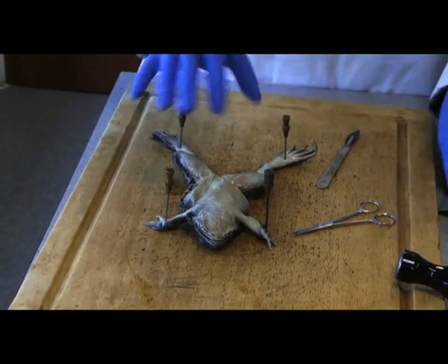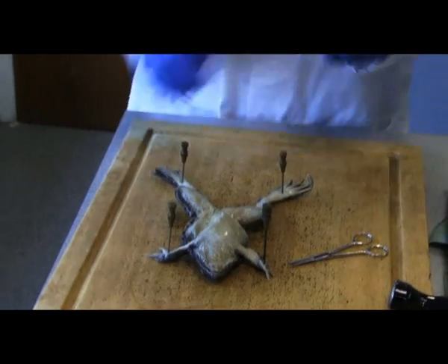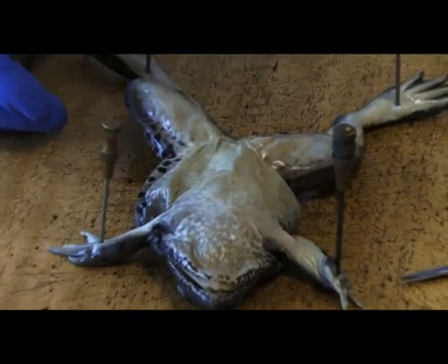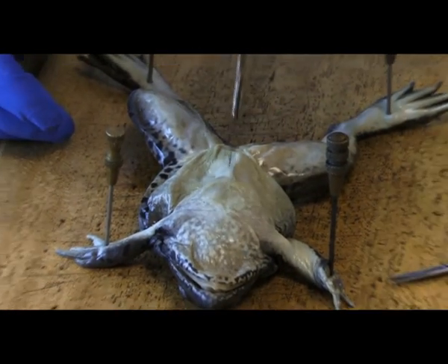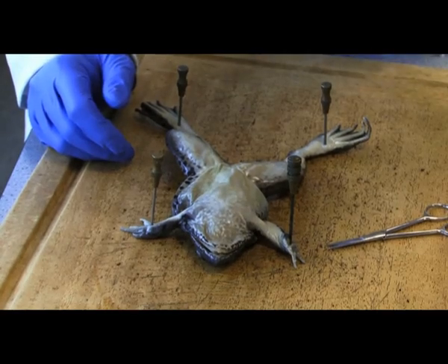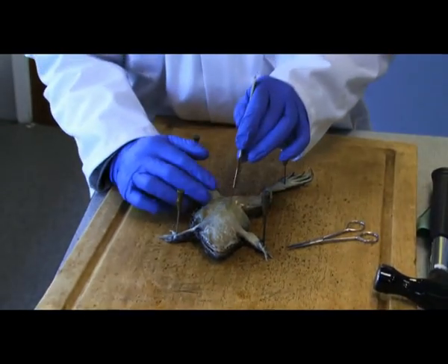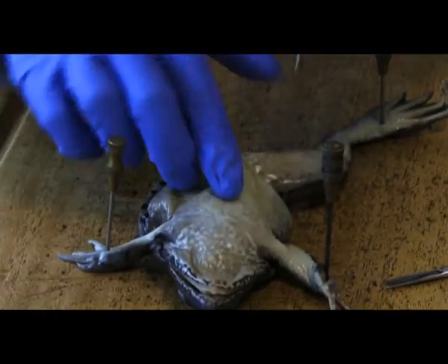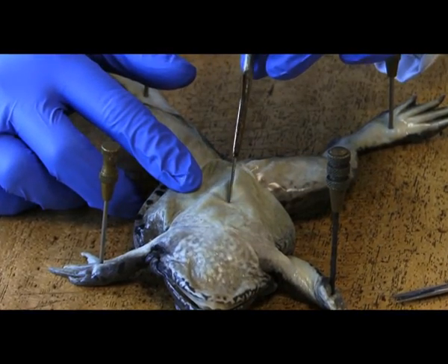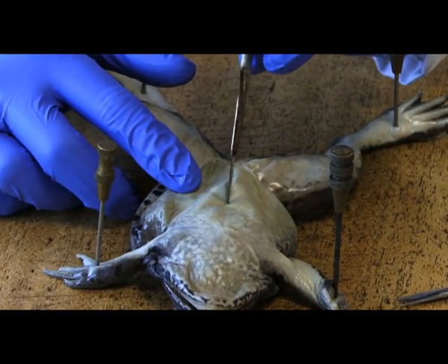Now we've got the frog stable. Get your scalpel — very, very important when you're doing it not to hold the scalpel downwards, because if you hold it downwards you're actually cutting directly down into the vital organs. Switch the scalpel the opposite way and make a small incision just roughly where the sternum is to release the internal structures first of all.